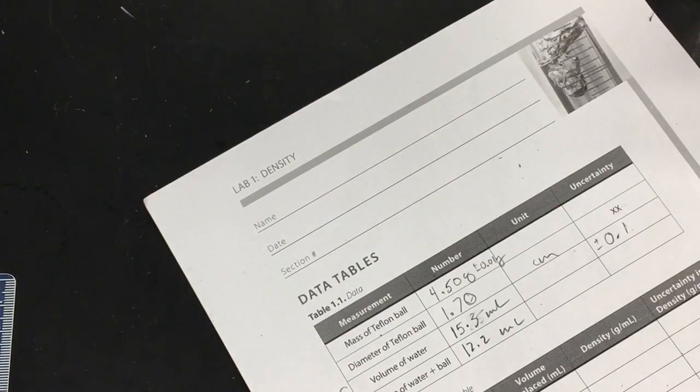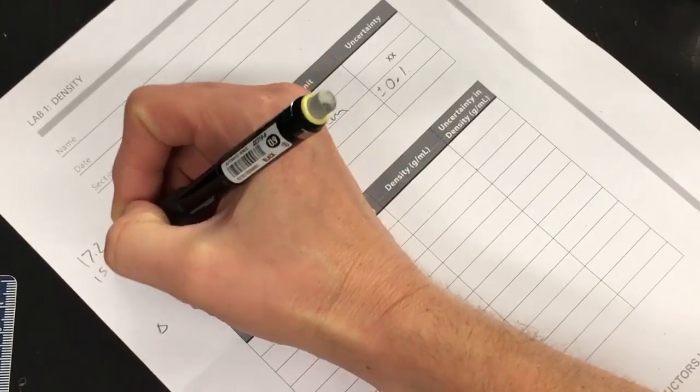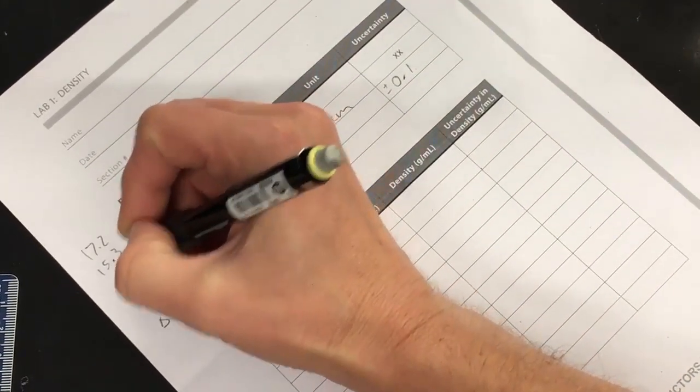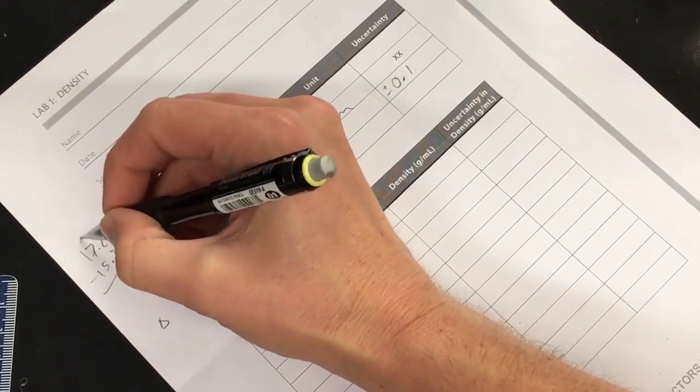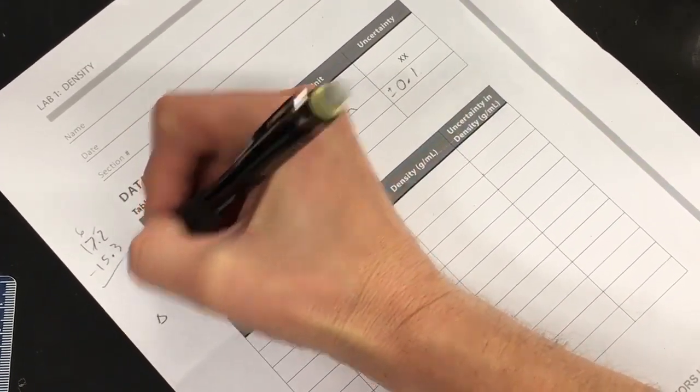Whenever we're taking a measurement, we don't actually measure what it is. We use some sort of device that will measure the delta. So real quick, I'm just gonna do some side math here. That was 17.2 minus 15.3, okay, 7, 8, 9.